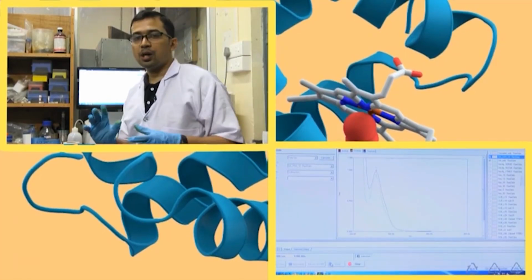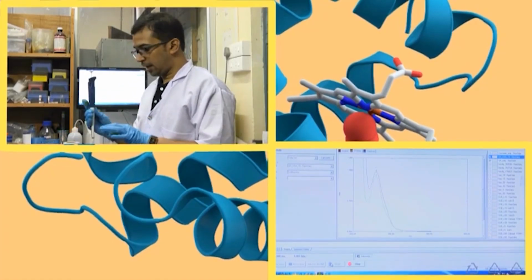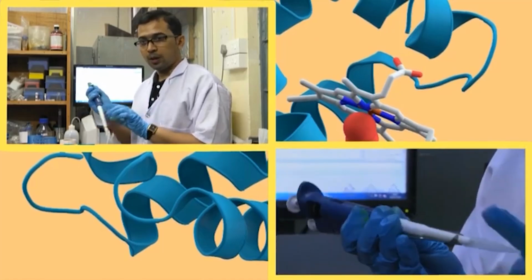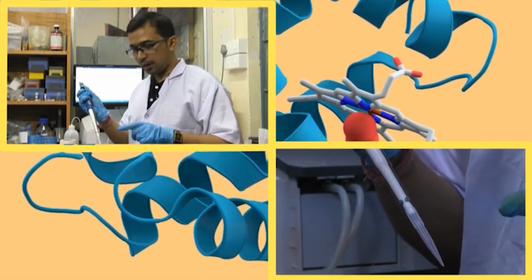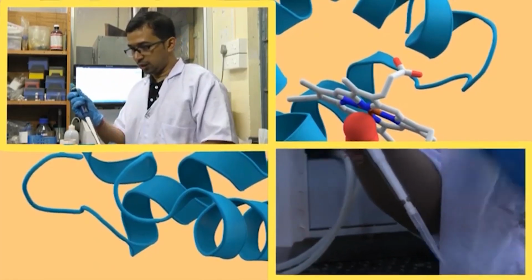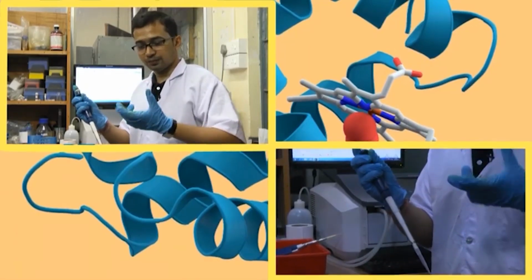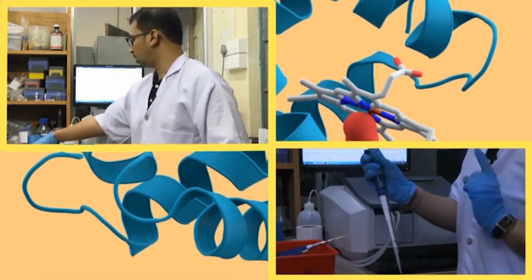Now, for convenience, what you can do is use a bigger micropipette, this type of micropipette, which has a bigger micro tip. You can put this within the cuvette chamber, or rather the cuvette, and mix it by moving it up and down. It will take solution from here and mix it. If you are not comfortable using that up and down method by hand, you can do it using a micropipette. So, let us see how this observation comes.